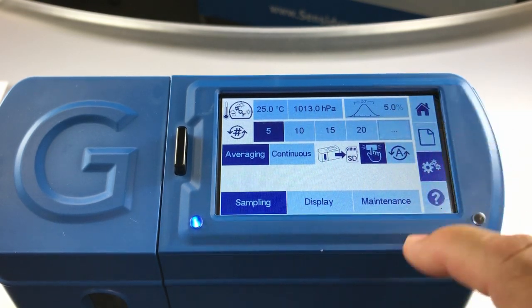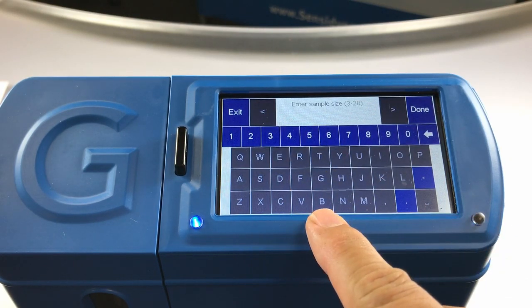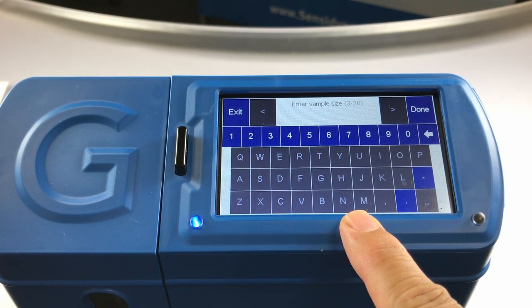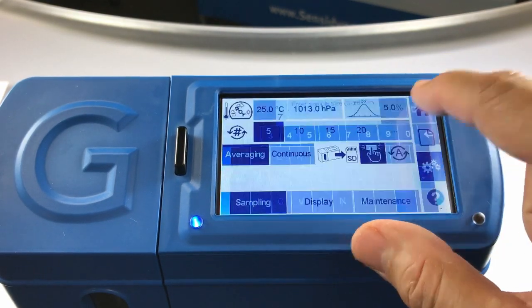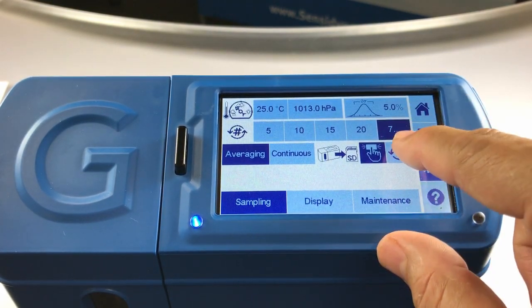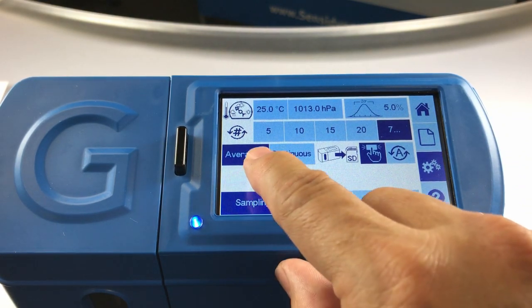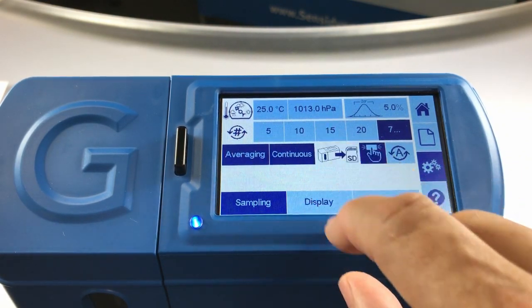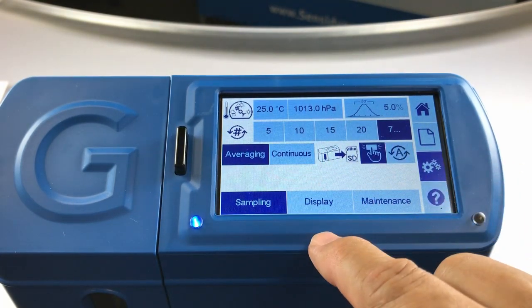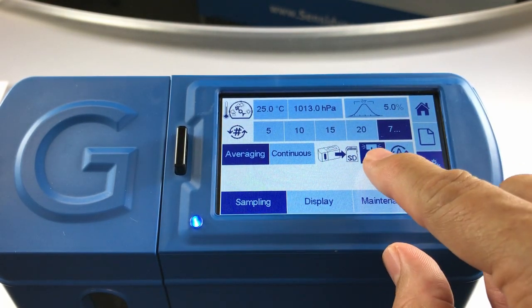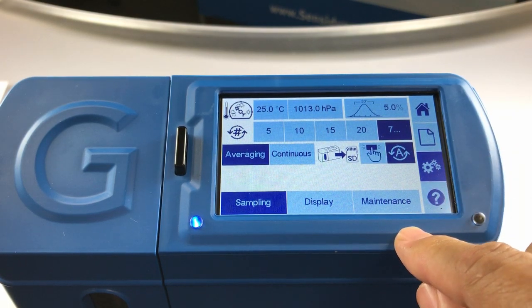You may choose from 5, 10, 15, or 20 samples, or you can hit the three dots at the end to enter your sample size — a value between 3 and 20. Once entered, hit done and it will populate in that last box. You may also choose between averaging mode or continuous mode, and in averaging mode you may select to have results automatically saved to your SD card upon entry.